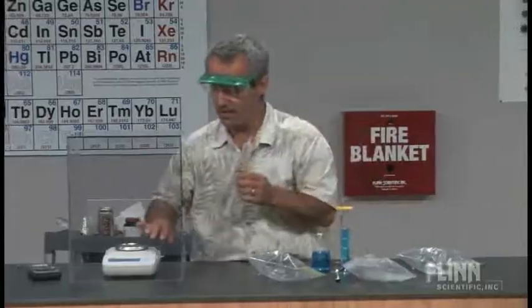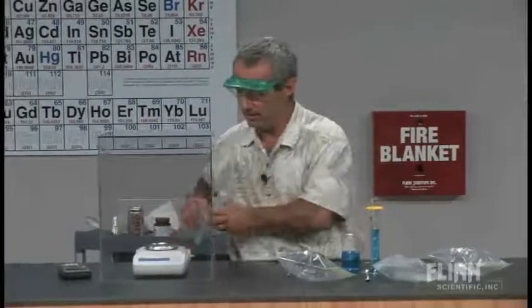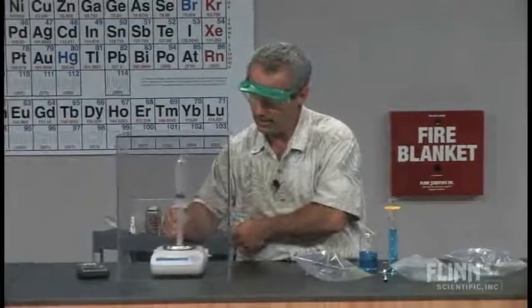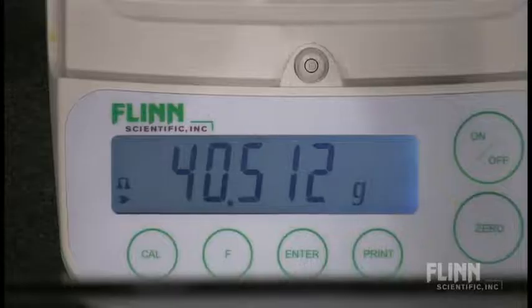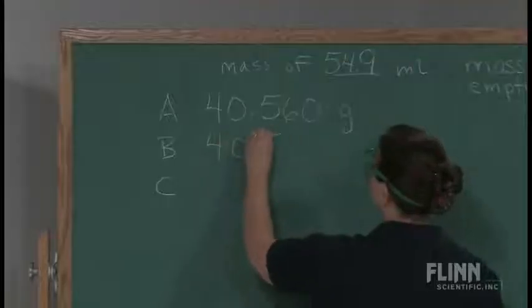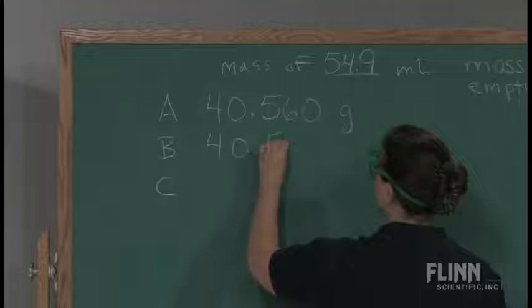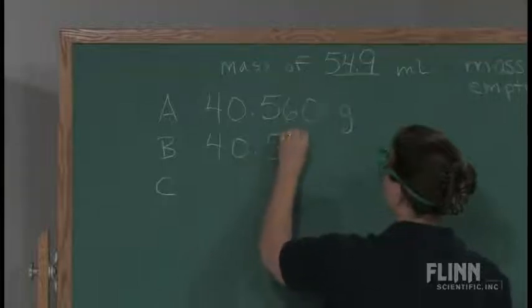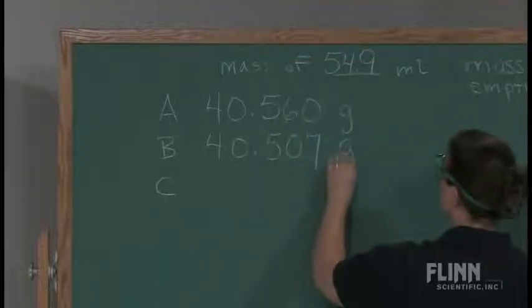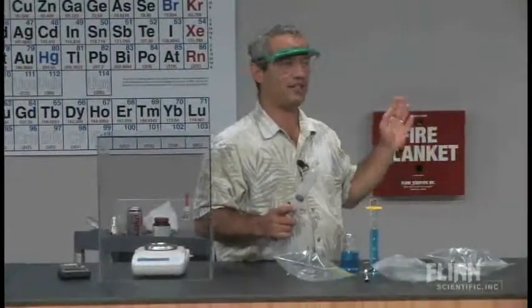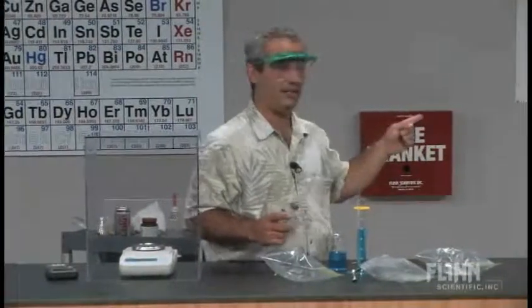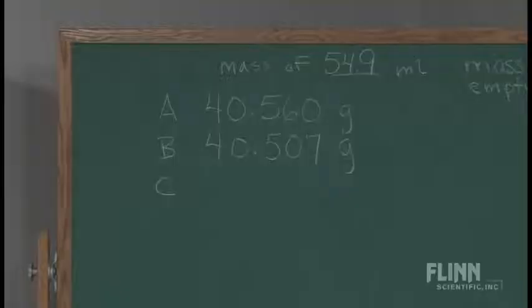This is sample B plus the syringe. So we'll re-zero it. And we're getting a reading of 40.507 grams. Even without doing any subtraction, I can just look at that and see that B is less dense than A.